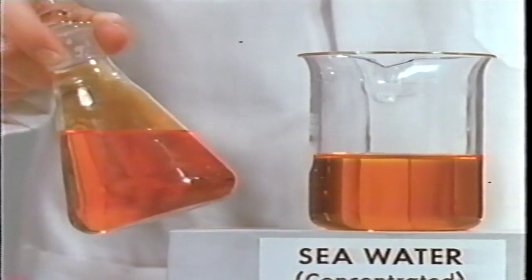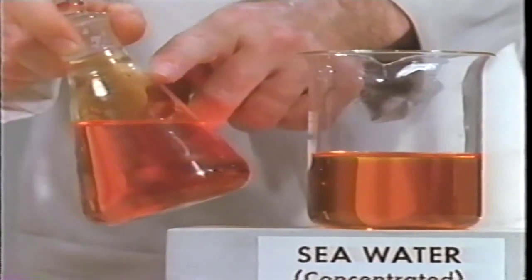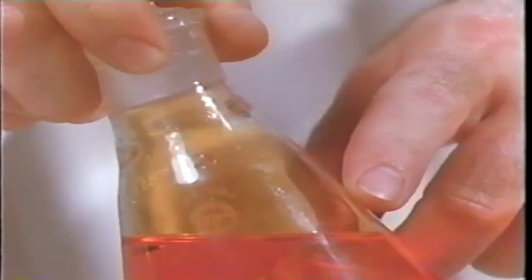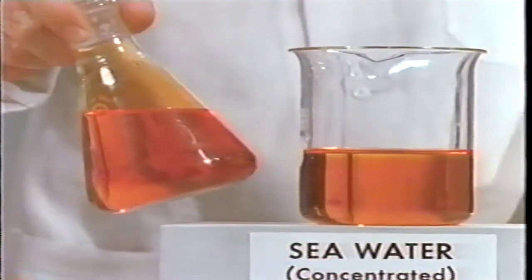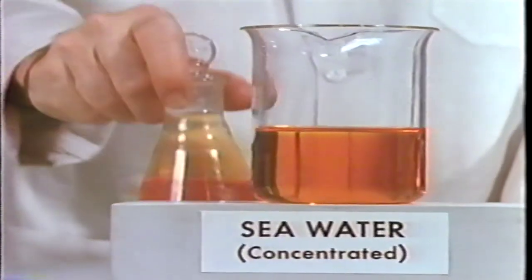A considerable amount of volatile bromine has accumulated in the airspace above the solution because of the low solubility of elemental bromine in water. The high volatility suggests that if bubbles of air are forced through the solution, they will carry away bromine gas.